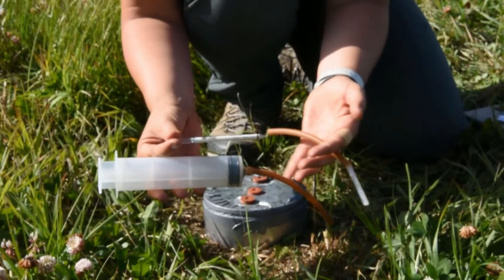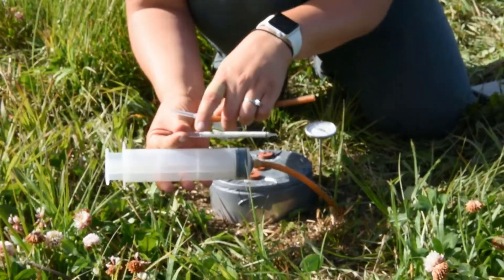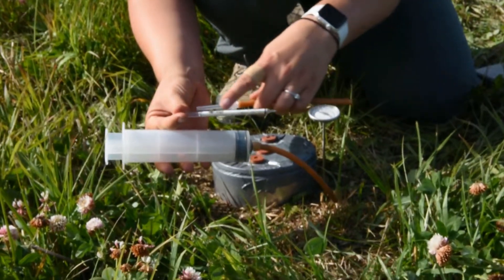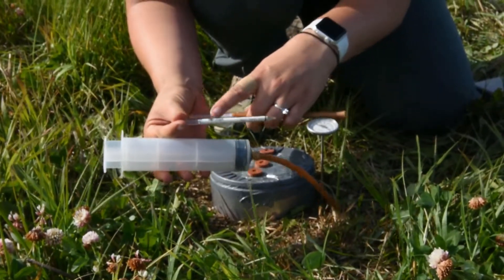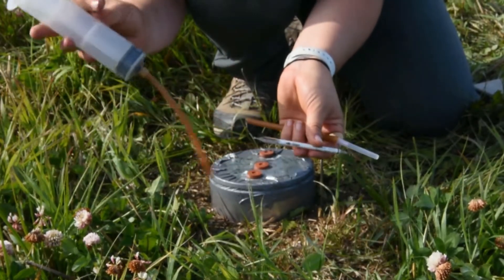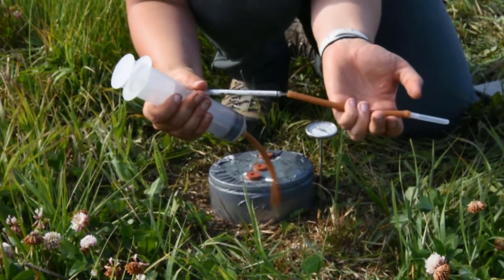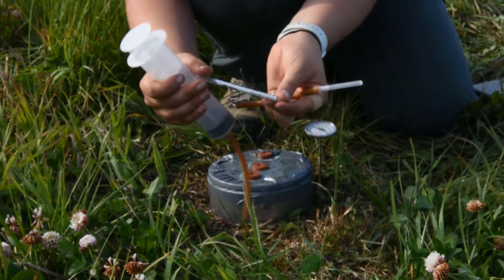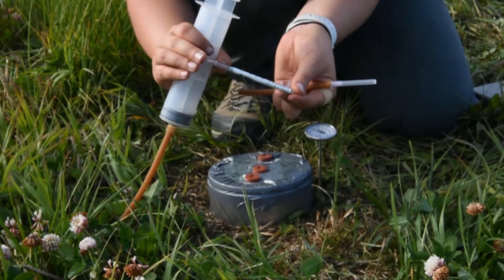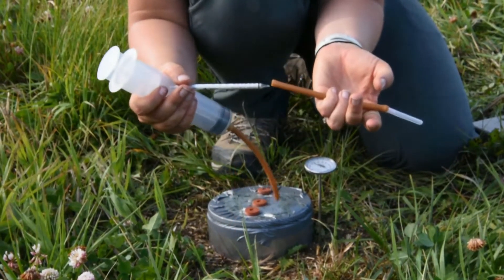Next we want to assemble the Draeger tube apparatus. As you'll see on the Draeger tube, there's an arrow pointing in the direction that the air is going to move through. You want to connect the arrow end of the tube to the syringe, and the other end goes into the stopper. You will use your garden clippers or nail clippers to clip the ends off of each end to put your apparatus together.